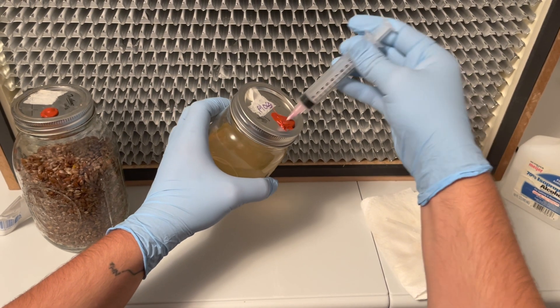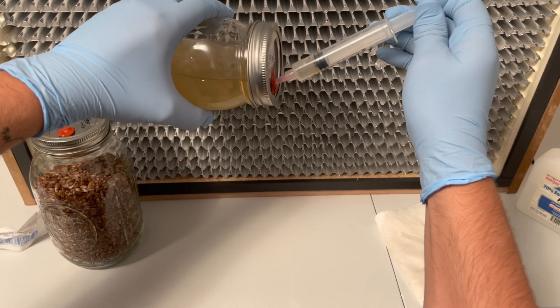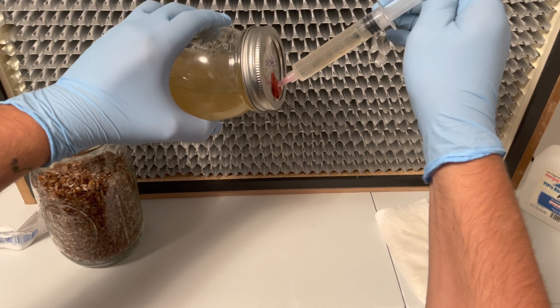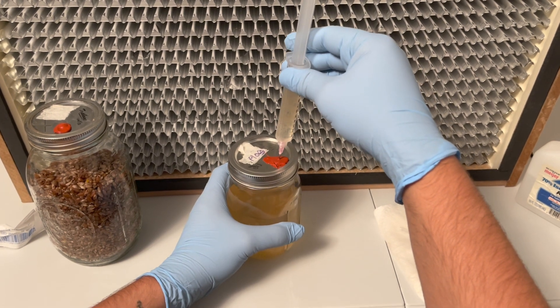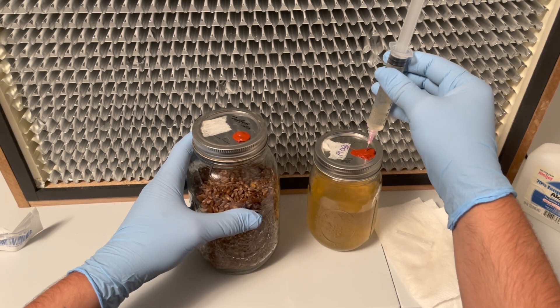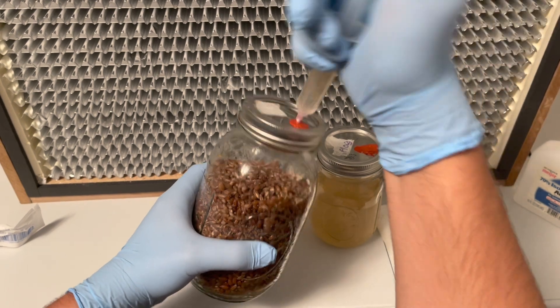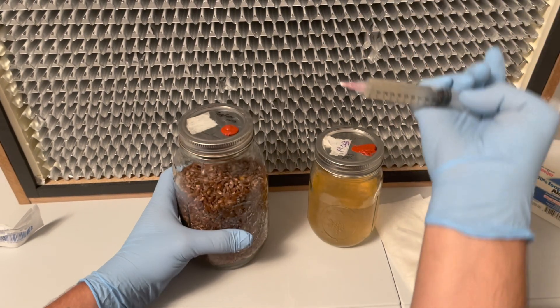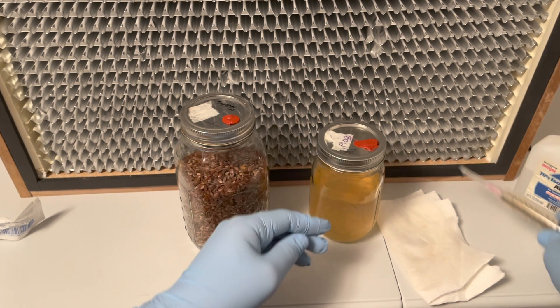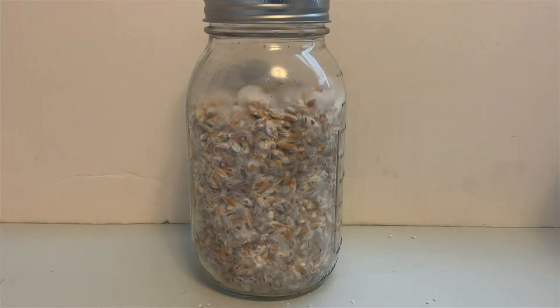Attach your sterile needle to your syringe and inject two milliliters per jar of grain spawn. Place your jars of grain spawn in a warm area and allow them one to two weeks to fully colonize.